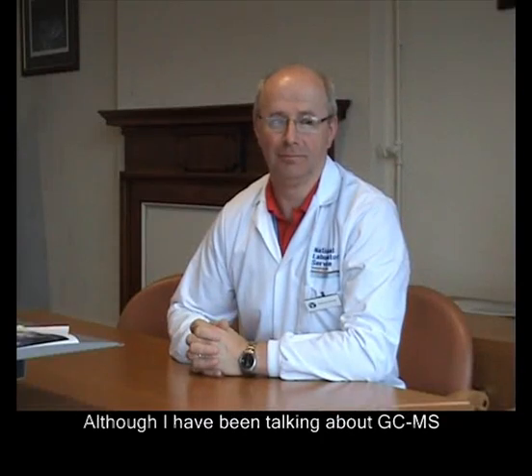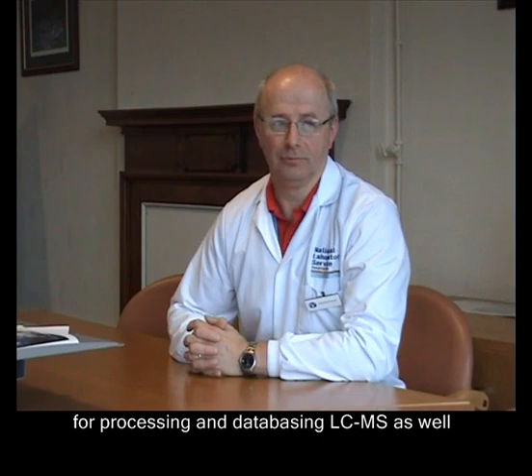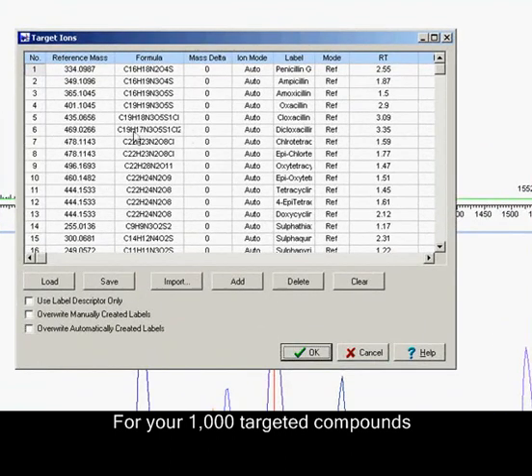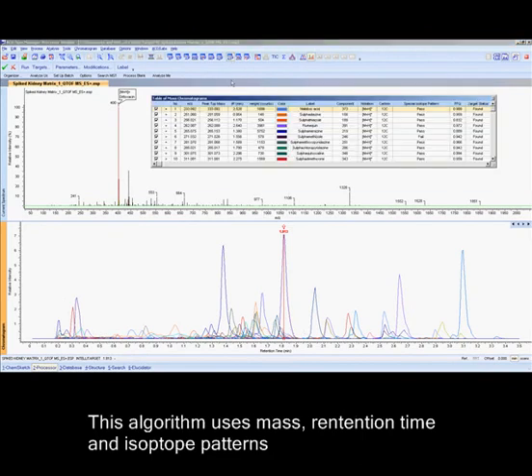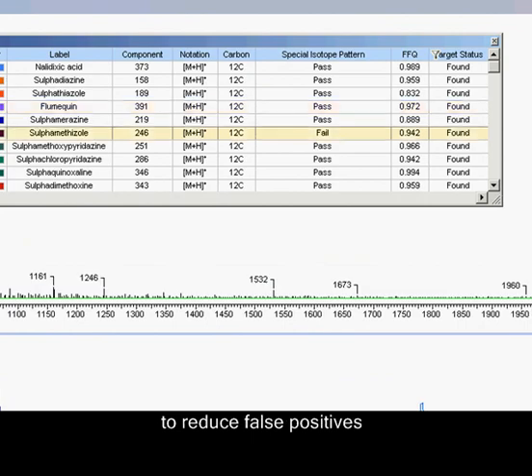What about LCMS? Well, although I've been talking about GCMS, you have all the required modules for processing and databasing LCMS as well. For your 1000 targeted compounds, you'll be using IntelliTarget. This algorithm uses mass, retention time, and isotope patterns to reduce false positives.